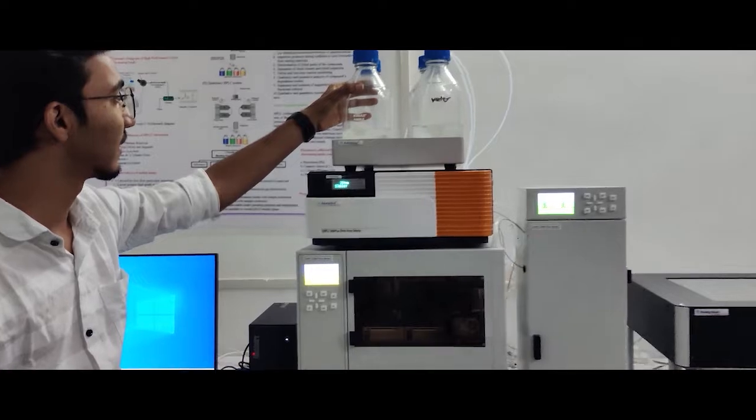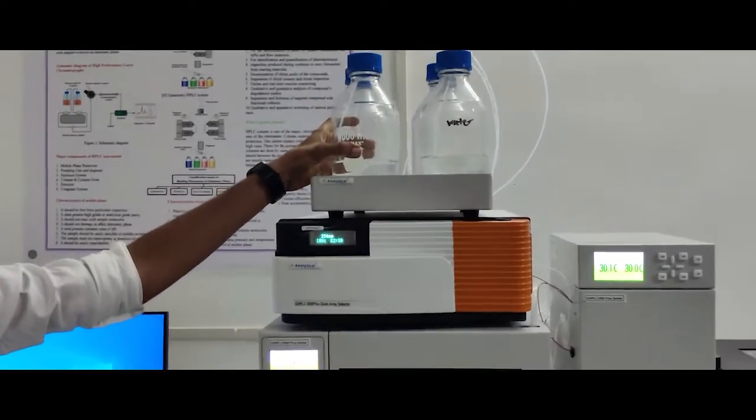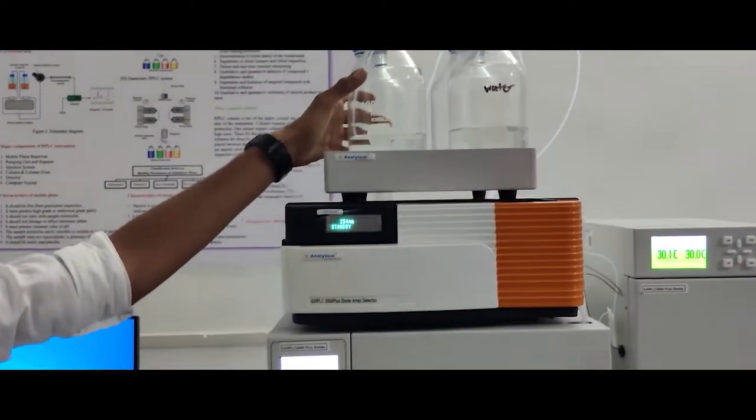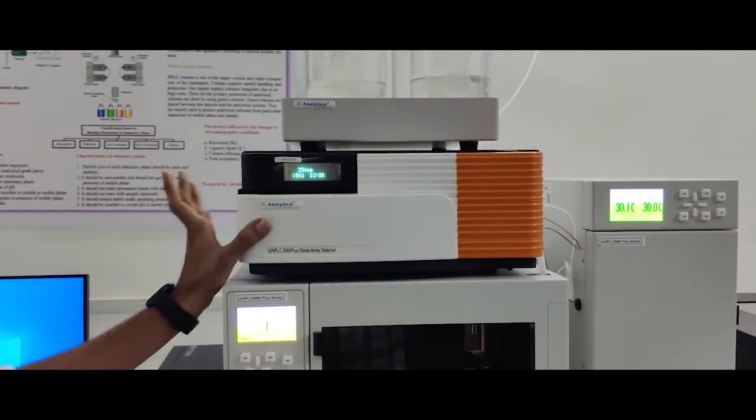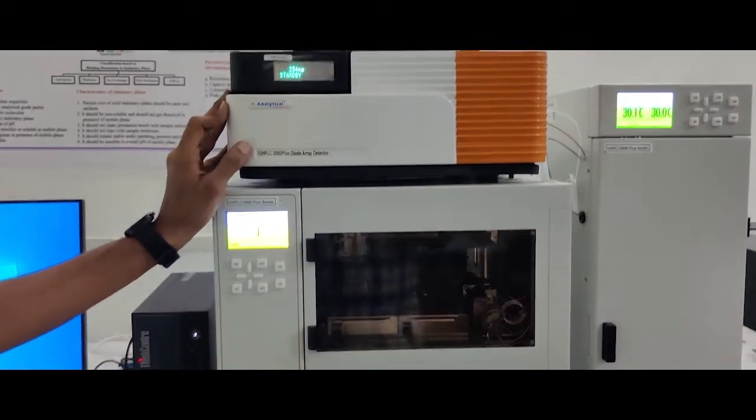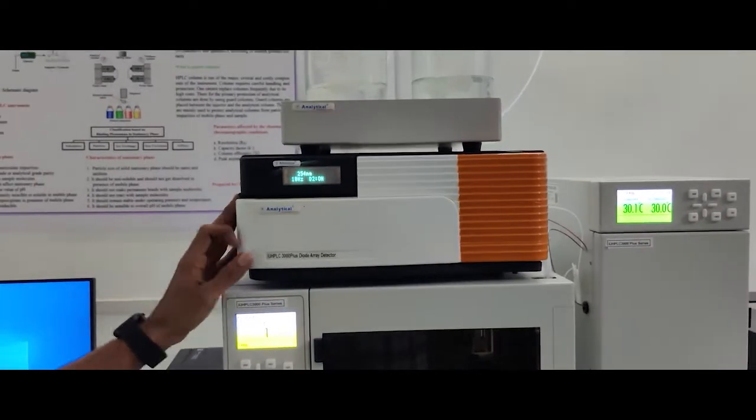This is a mobile phase model, DAD detector—diode array detector.